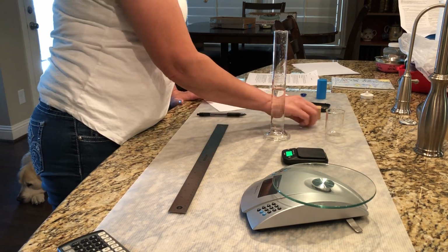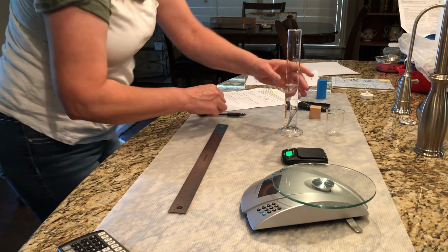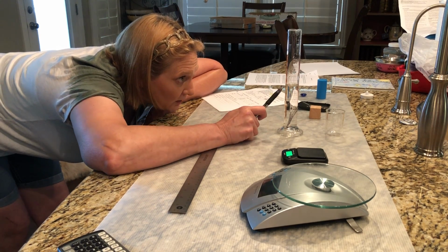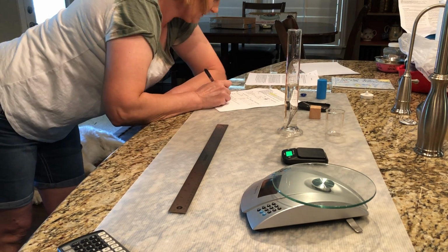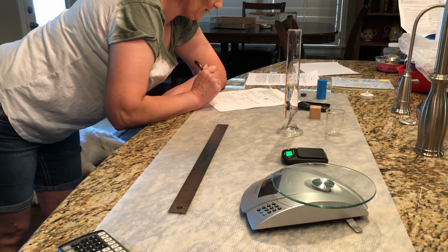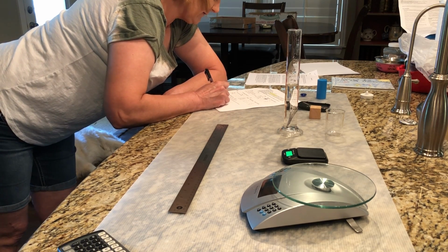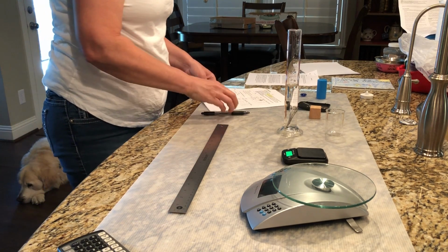And then I am going to add the nail cutter without breaking it. The final measurement is 63.5 mLs, with the 5 estimated. So volume of nail cutter would be 2.5 mLs.